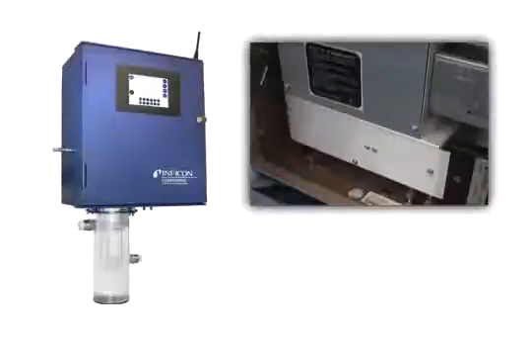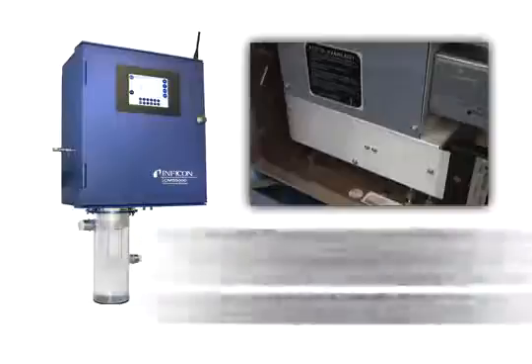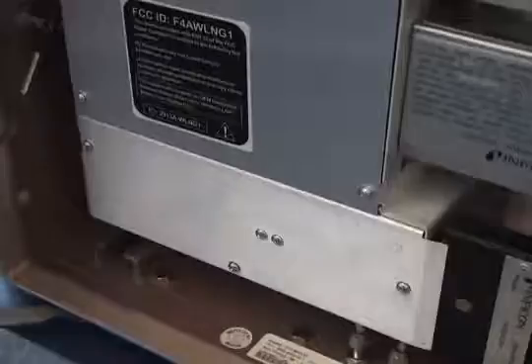The CMS5000 uses a toluene permeation tube as the internal check standard. The permeation tube emits a known amount of toluene onto the tri-bed concentrator. The toluene is then desorbed onto the GC column, where it elutes at a known time. The response of the toluene to the detector creates a correlation factor in the software, which is then applied to the method.